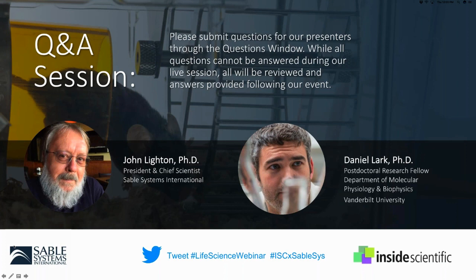Yes, it absolutely does. This is another elusive thing in the literature. There are a number of studies that have shown that, like I just mentioned, wheel running can increase daily energy expenditure, but to my knowledge, the only studies that have been able to show a linear relationship between the distance traveled and the energy expenditure increase have been from Sable Promethion studies. I don't know of any other instrument system that has been able to show that.